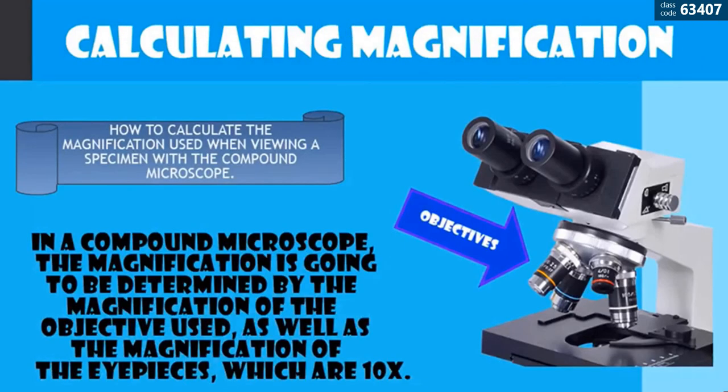Okay, so calculating magnification. How to calculate the magnification used when viewing a specimen with a compound microscope? So as you can see, this is a microscope. This is a compound microscope. And we are given objectives. They are four in different magnification. In a compound microscope, the magnification is going to be determined by the magnification of the objective used, as well as the magnification of the eyepieces, which are 10x.